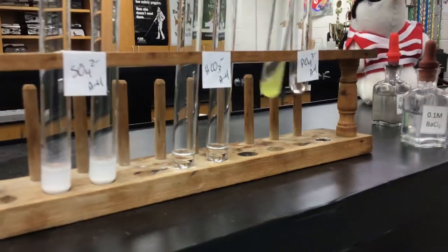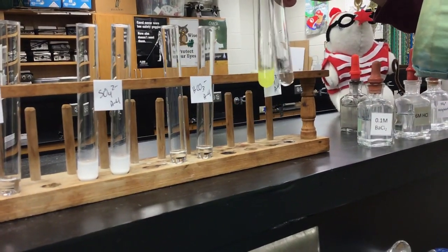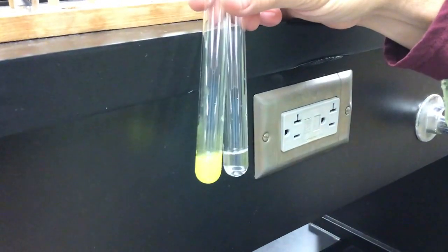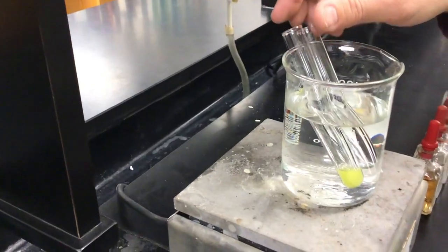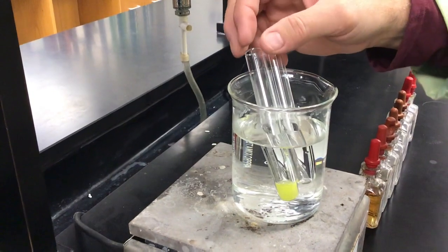See, everything's happening there. On this particular test, sometimes it requires just a little bit of energy. We'll put this in a hot bath, or a warm bath rather, and see if we see any change in the results. So I'm going to take these two over here for a little warm water bath and let them sit for a minute or so. Remember, the known is the yellow one on your left, and the one on your right is your unknown.